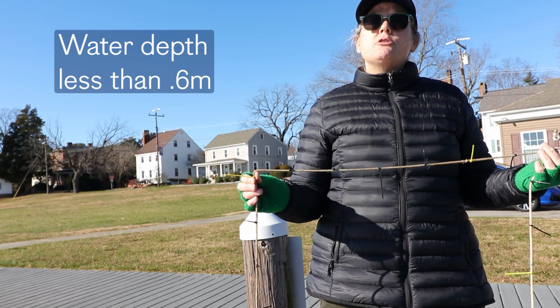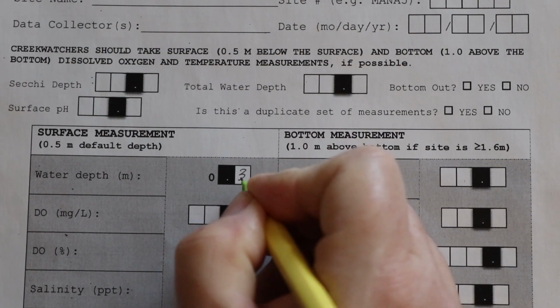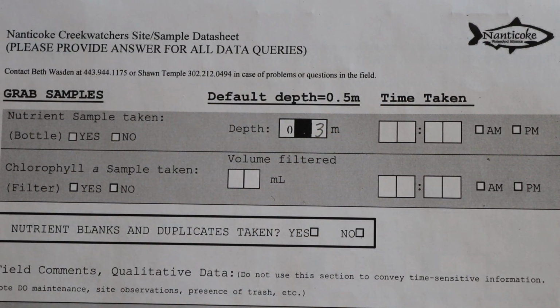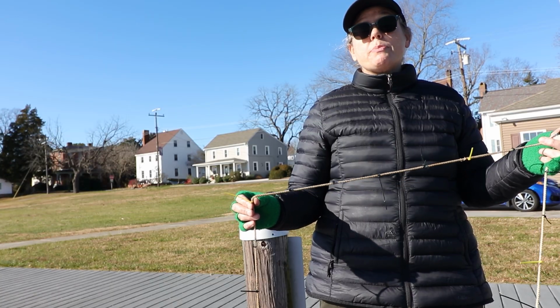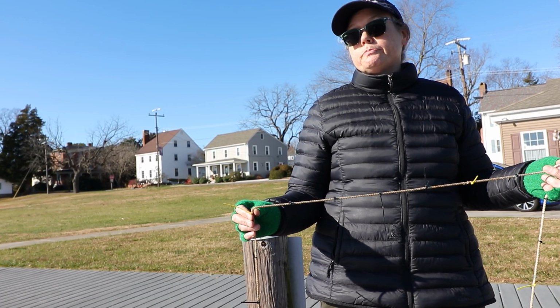That means we need to take our DO meter depth profile measurements and get our water samples at 0.3 meters. We're going to record that on both the site sample data sheet, where we put information about our water samples, and also on the water quality data sheet.